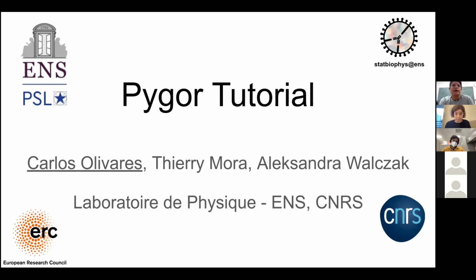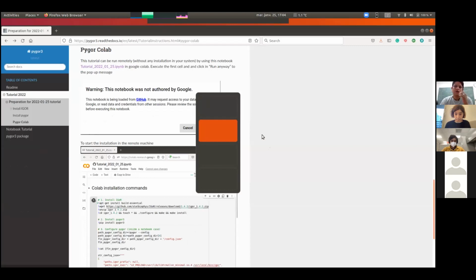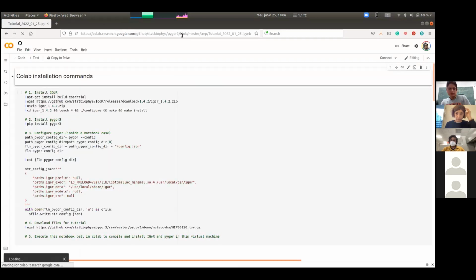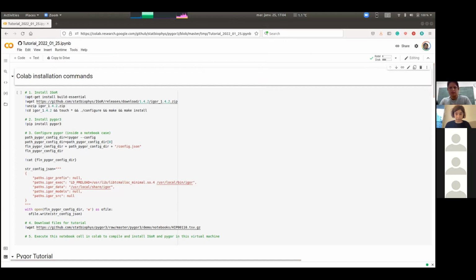As Alex mentioned, there is a collab version for this tutorial that you can access from the website. This is the link. I guess someone can put it in the chat if you want. I'm going to put it in case there is someone that couldn't install Pygor in their system.